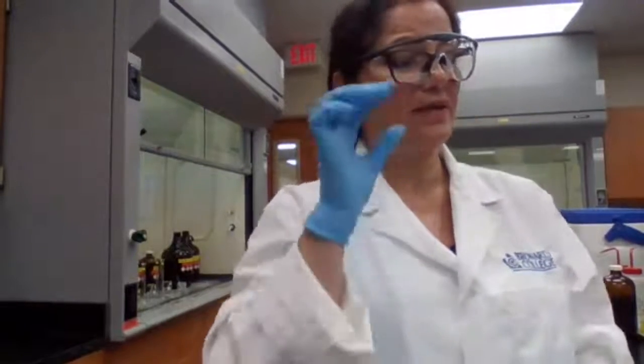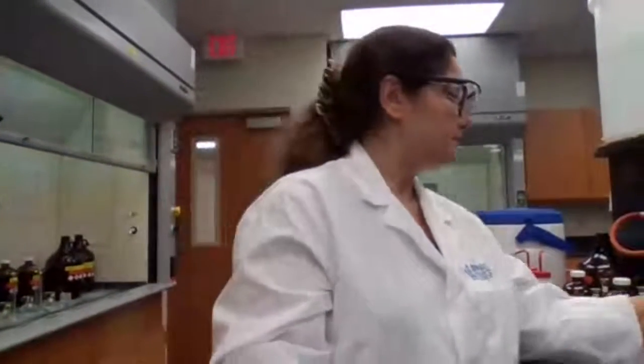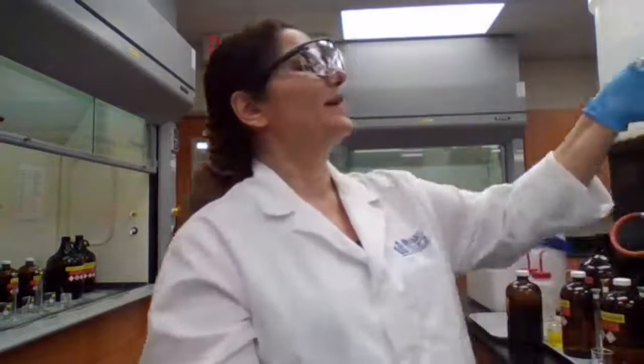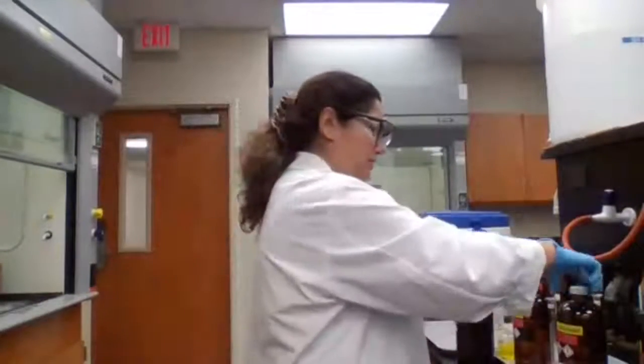We're done with part B. We are moving to part C of the experiment, that is for ammonium chloride. Going to find a clean test tube. There are plenty of test tubes, but you need to find a clean test tube. That's the challenge now. Find a clean test tube, add 1 milliliter of saturated ammonium chloride.